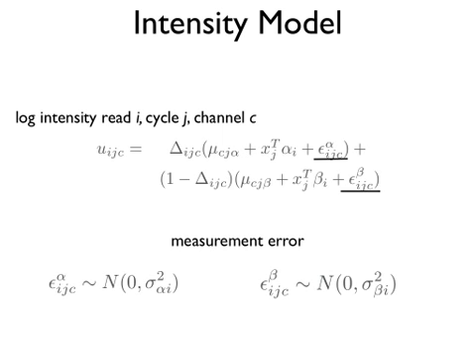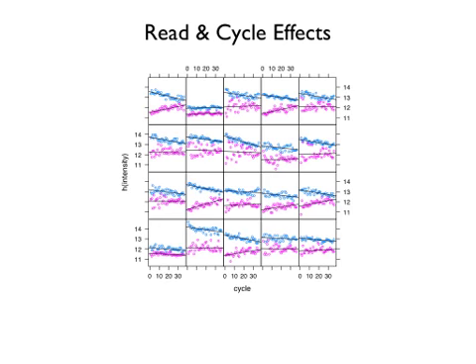But we can also talk about probabilities of it being each one, and then we'll get a way to have uncertainty for each base. So this is the real data. We fit the model. You can see it fits pretty well, and you get the decreasing signal and the increasing background.